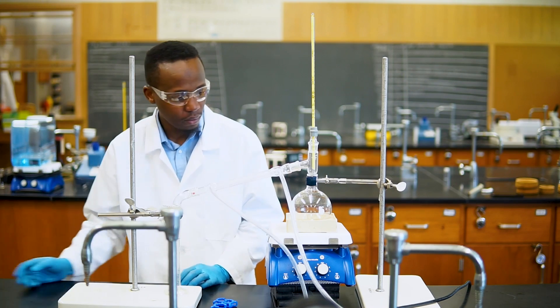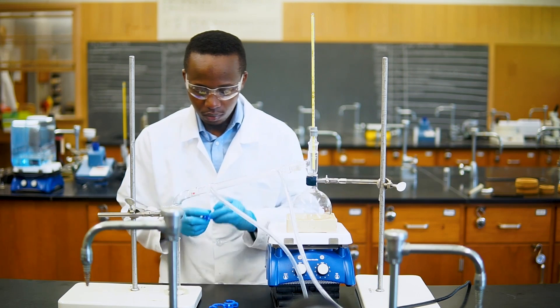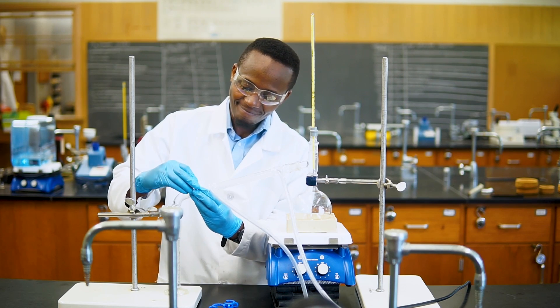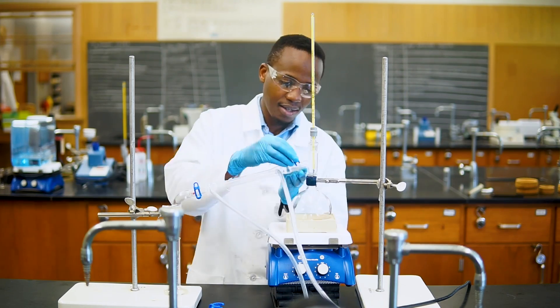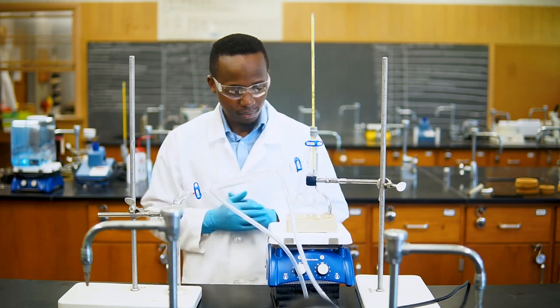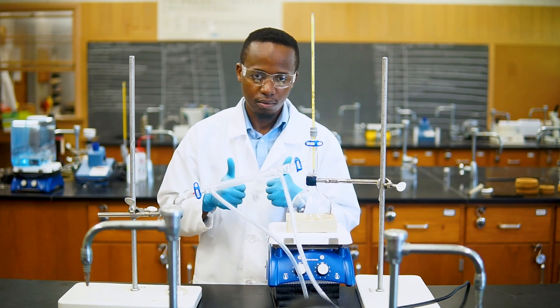This is our complete setup. Make sure you examine every joint to ensure that you have a tight seal. Also check your clamps and adapters to ensure that nothing is loose. We can further secure our setup by adding clips that clamp all the joints together so that the glassware does not separate. You can now turn on the cold water and make sure that it flows smoothly through the condenser. We are now ready to start the distillation.